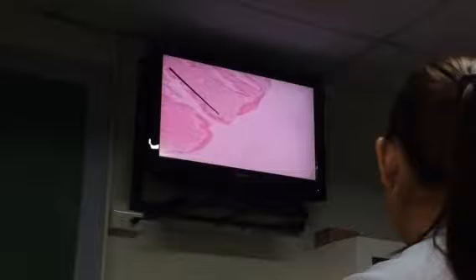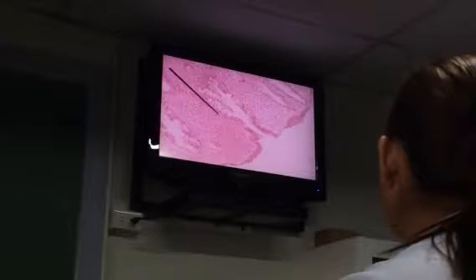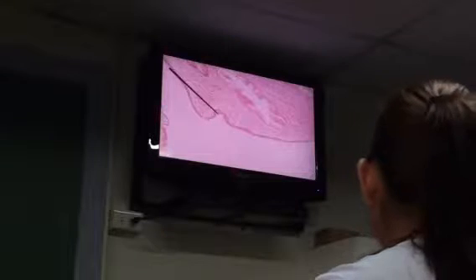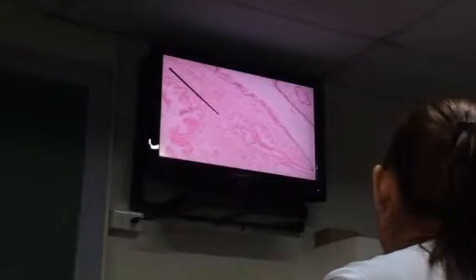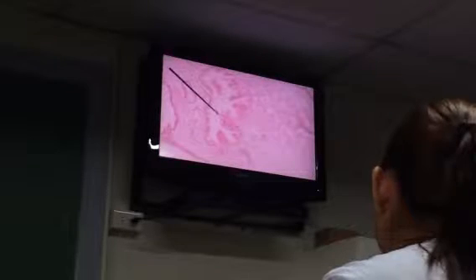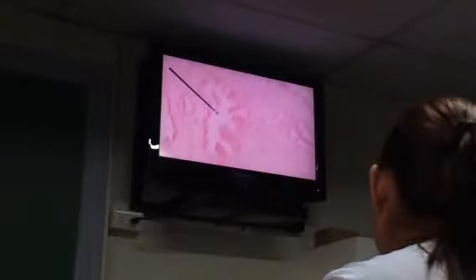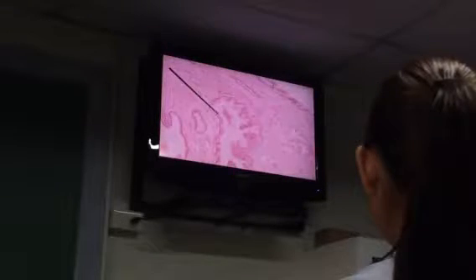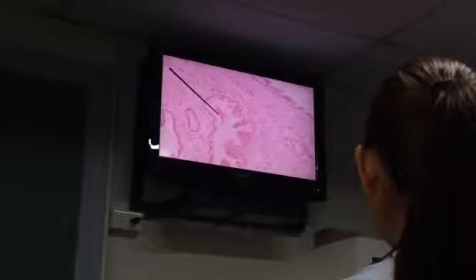Now, what is the difference as to histology between exo and endo? In the endocervix, you will still see plenty of your cervical glands. These are your cervical glands that you find in your lamina propria. Again, this is mucosa, of course, supposed to be lined by simple columnar. And these are the cervical glands which secrete mucus for lubrication.